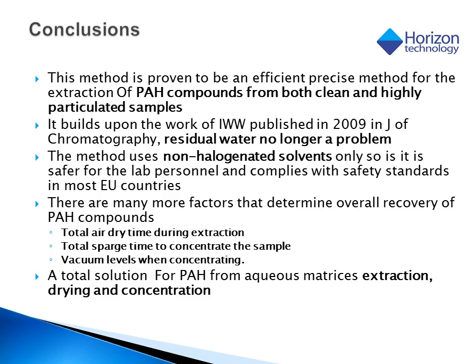There are many factors affecting the efficient extraction of PAH compounds. Many of these factors are associated with drying and concentration of extracts, like the amount of time that nitrogen gas flows over the samples, and also the length of air dry times during the extraction. We think that each of these factors can be further optimized in future work.